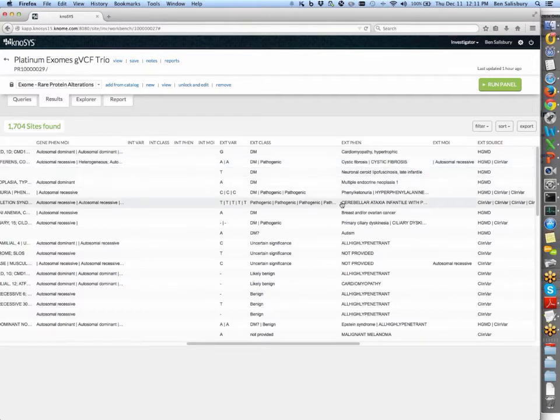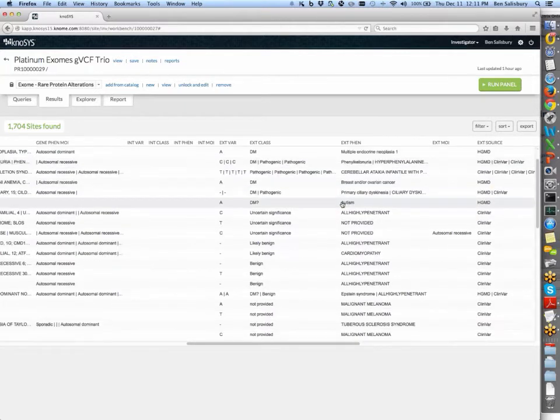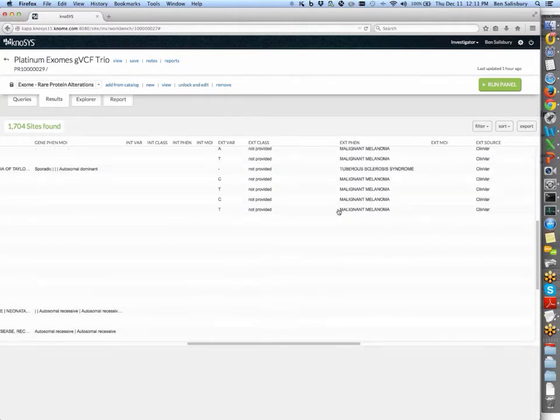We see a wide variety of traits. Looking back at the gene level information, we can see that some of these are expected to be dominant or recessive. So it's still quite a lot to go through, and the list stops pretty quickly. So we're still left with well over 1,000 variants that have no classification information in them. So let's step back from this full exome and focus in on a particular area of interest.